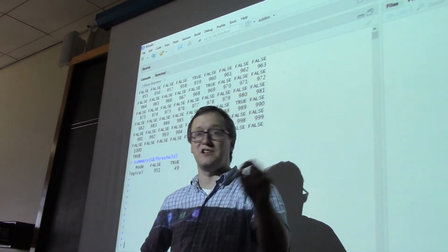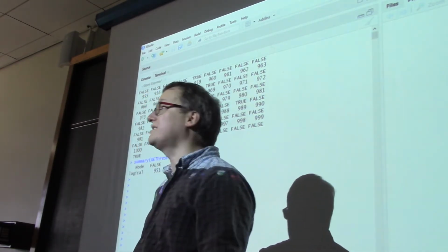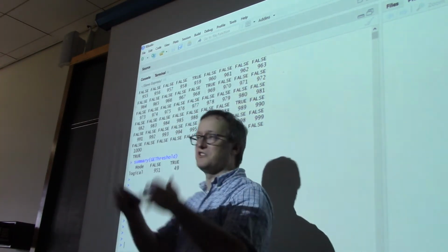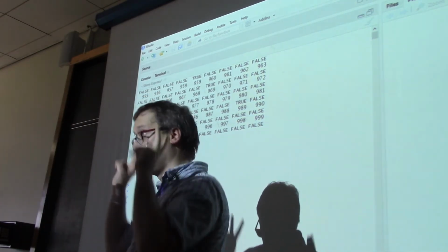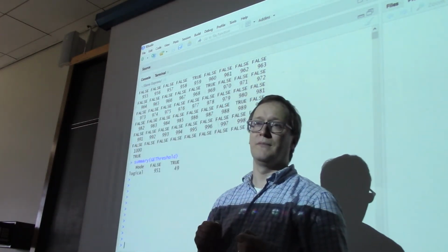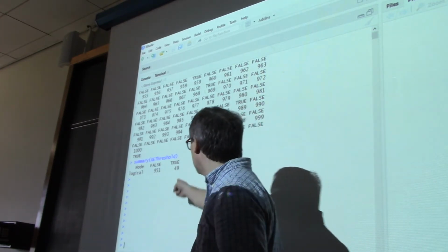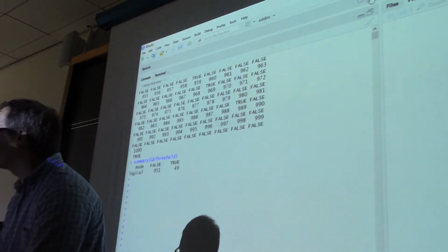There are real differences that have been simulated into this data set that we failed to recover by the statistical method. That's something we have to get used to. Whenever you're doing an experiment in mass numbers of tests, thousands of genes, thousands of proteins, you have to accept some of them will be differential, but you won't be able to recall them. Your sensitivity will be insufficient to get down into that set. So, very worth noting, if you're doing lots and lots of tests, don't expect perfect accuracy on your method for detecting differences. Here we lost about half of them. Okay, with that scary note aside, let's return to our source code.